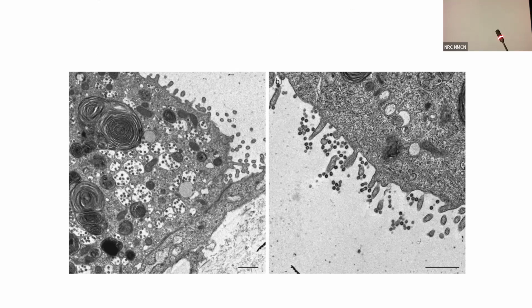Something which was causing havoc in your life for the past 2.5 years. COVID. So virus particles, can you look at them in the light microscope? No. So what do you require? So where are these? So you see these beautiful viral particles, right? You can see them here also.